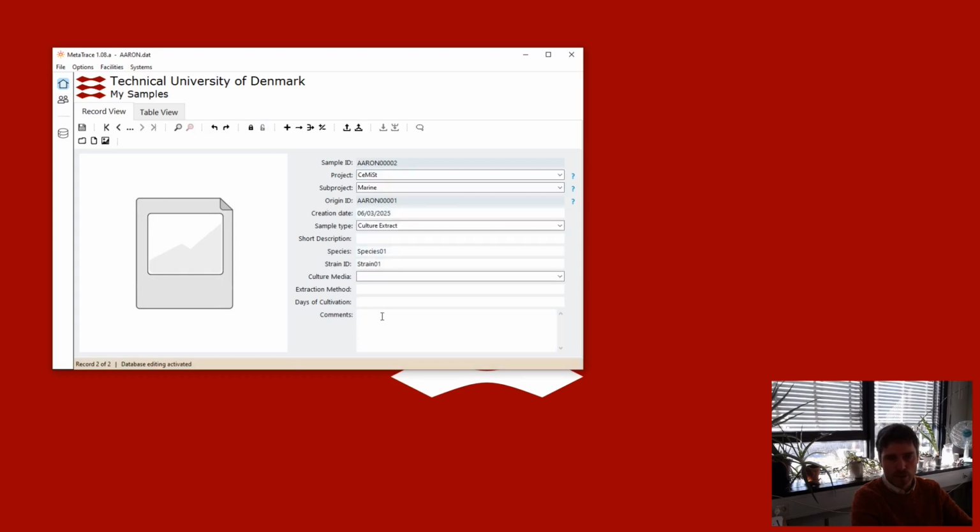So you could add a comment here, and then if I can even spell comment, I can just go Control to the left, it will take me to the previous record, and I'm already in the comments, and I can add in my next comment as well. So that could be quite useful for quickly adding in details. Yeah, so there's navigating through your records.